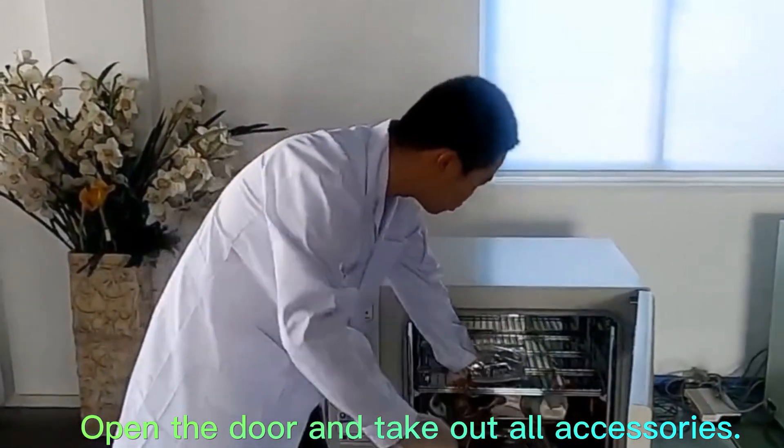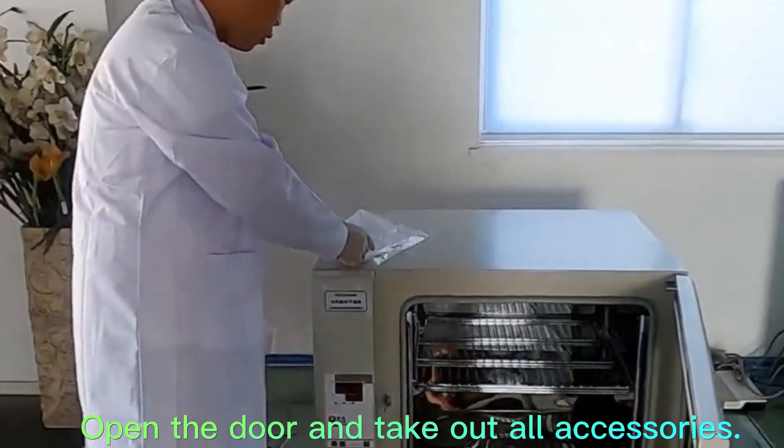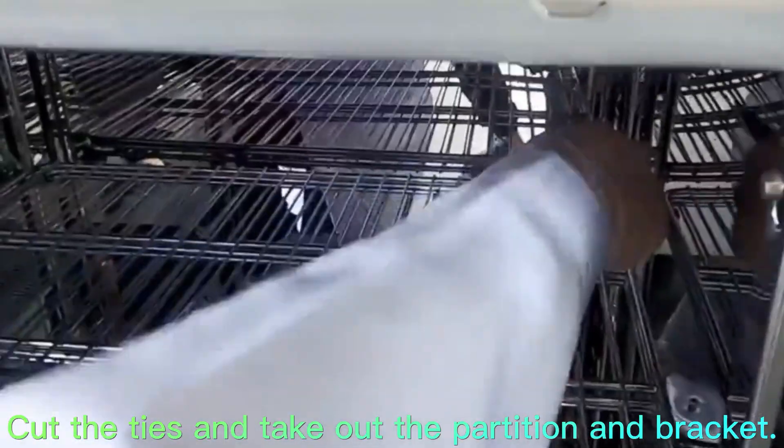Open the door and take out all accessories. Cut the ties and take out the partition and bracket.